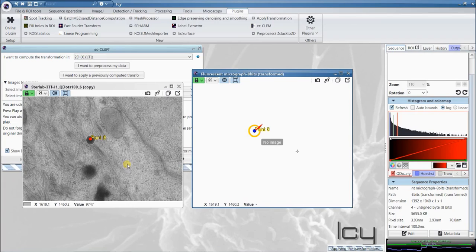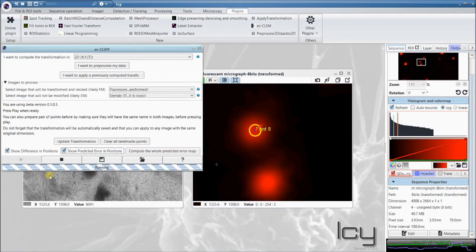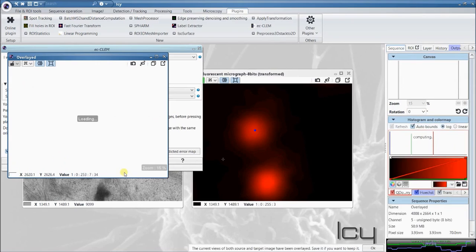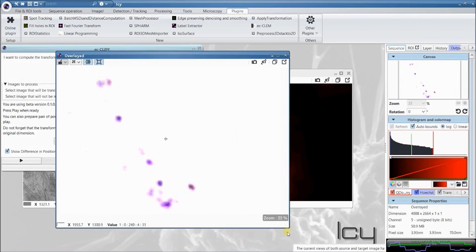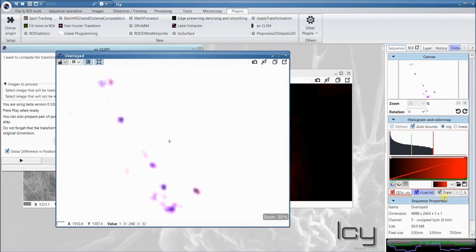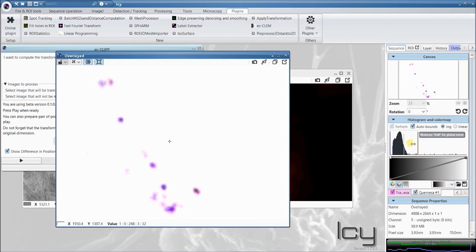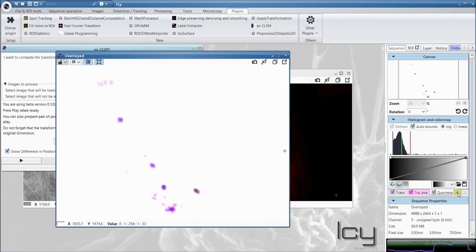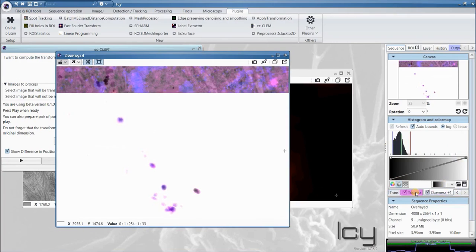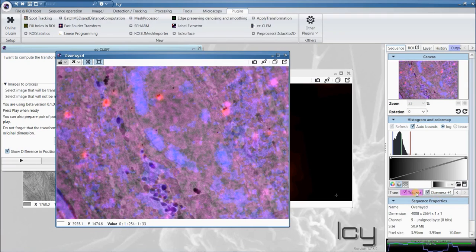And once you have a satisfying number of points, you can then simply stop the plugin, and it will create automatically the overlay multi-channel. When you go in here, this image, you have an extra channel that comes in, which is the electron micrograph, that you can adjust. And you see, nothing appears. It's because of the transmitted light, which is in here. If we switch it off, suddenly the electron micrograph appears more clearly.